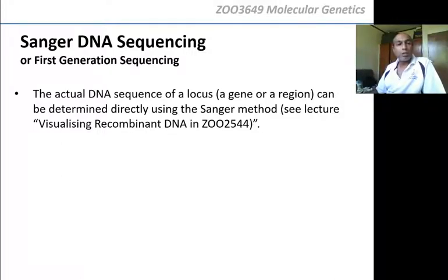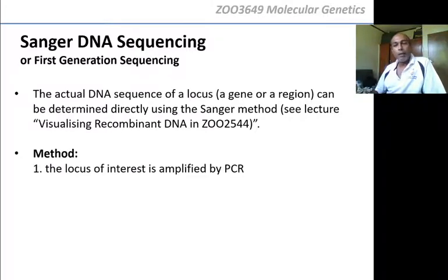We're not going to be concerned about the Sanger method too much in this module. We're going to be concerned mainly about next generation sequencing. But I'm giving you this because, in the modern day, if you are doing postgraduate work, you will see Sanger sequences and you will have to be able to deal with them, right? And this is why we're dealing only with DNA sequencing in third year. Just briefly go through the Sanger method.